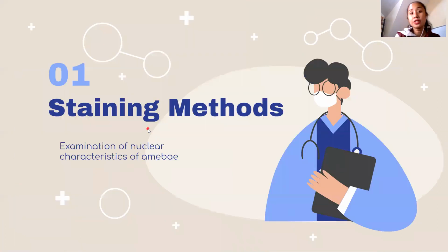Okay, so let's start with your staining method. So usually, we stain because we want to examine the different inclusions that are in your amoeba. So we want to know the nuclear characteristic, if they have chromatoidal bars, ano pa, if they have glycogen inclusions. So usually, if it's for amoeba, yan. Usually, we don't stain helminths because they are distorted in staining.